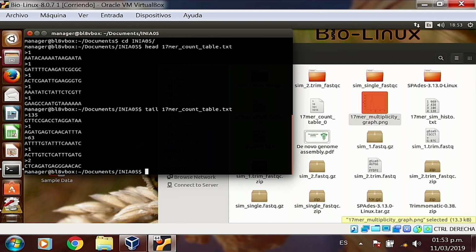It was seen from different reads, because each read was divided into smaller Kmers and recorded into this count table. So all we're doing here is counting how many times each of these Kmers appears in my library. That's all we've done. Is that clear so far?